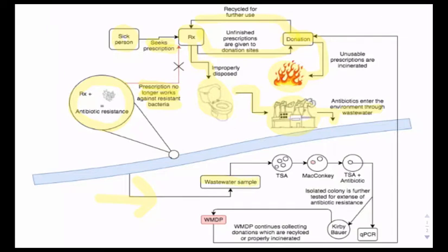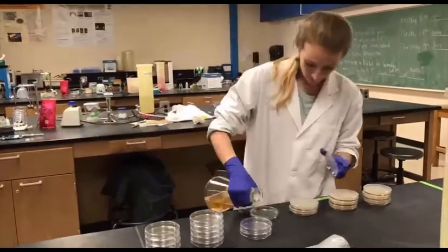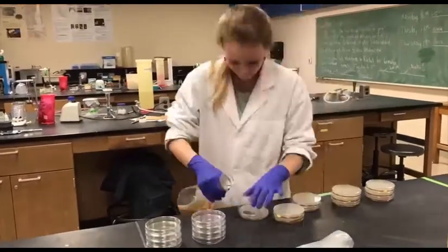The first step was obtaining influent water samples by mail from the 6 Wyoming counties we chose to study: Sheridan, Laramie, and Albany, who participate in the WMDP, and Sublette, Carbon, and Niobrara, who don't. We prepared media to sustain bacterial growth from the water samples.